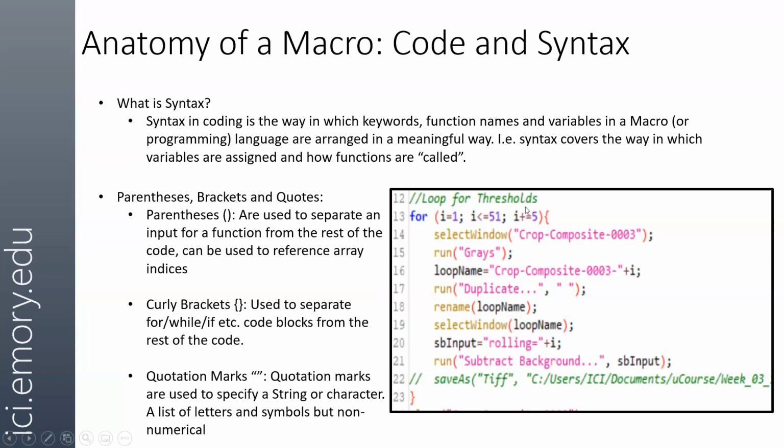The same way here at the top, the parentheses delineate these calculations and these comparisons inside of them without consideration for the code around them until that calculation is complete.